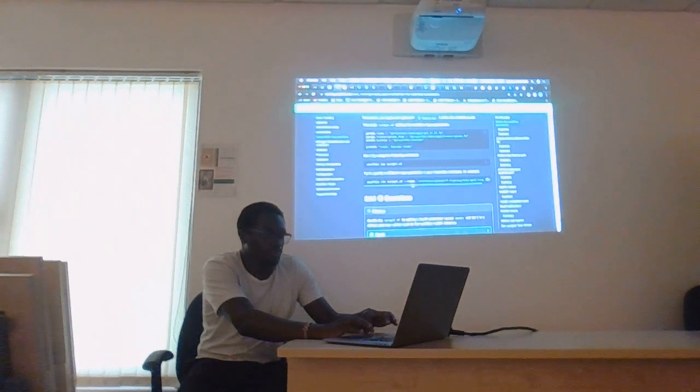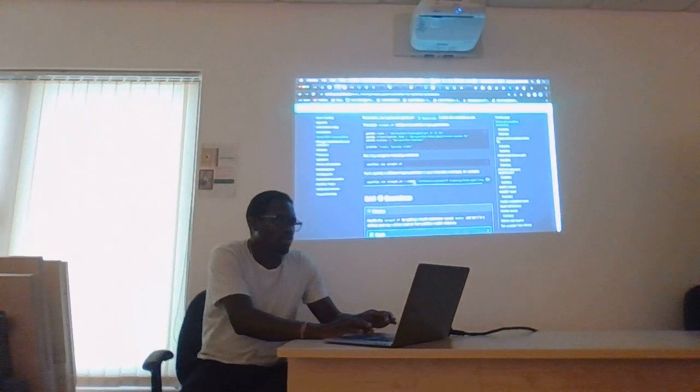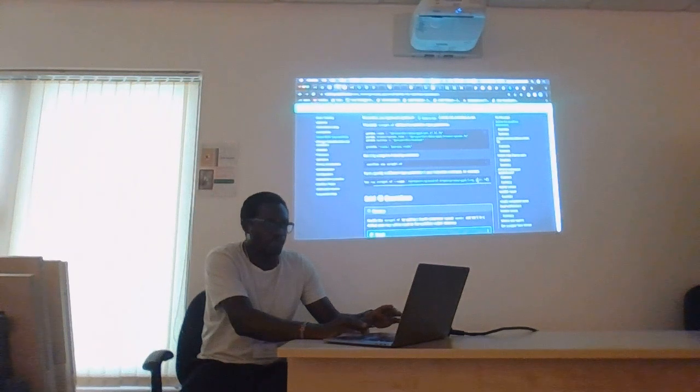So what you'd simply do, similar to what you do in Python or any scripting language that requires some kind of arguments to be passed, you call that argument using this double dash and the name of the parameter. So the parameter here is reads, and specify a different path. Normally it's advisable to specify the whole path and in quotes, and then still use the pattern matching method to identify which files you want to work on.